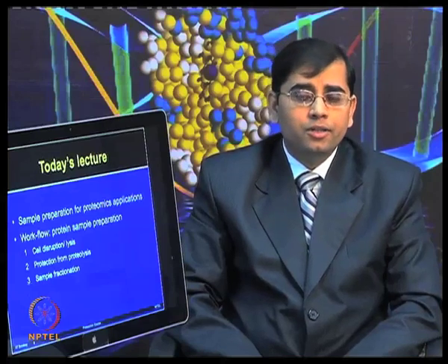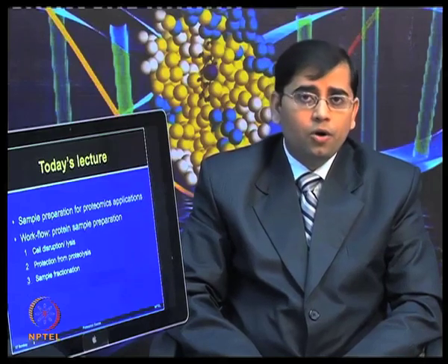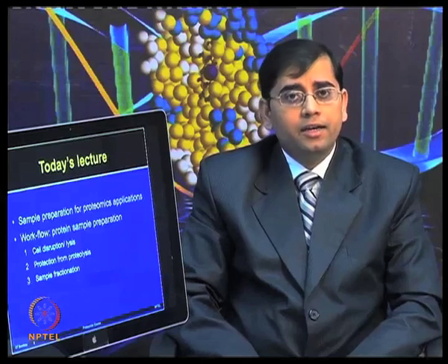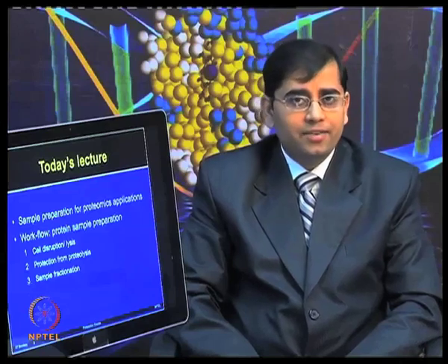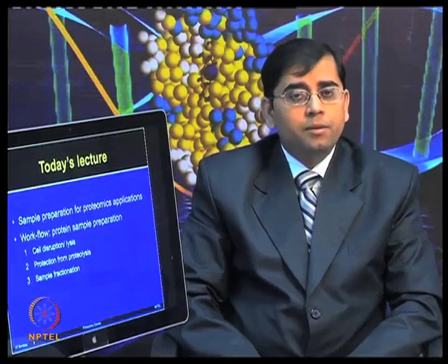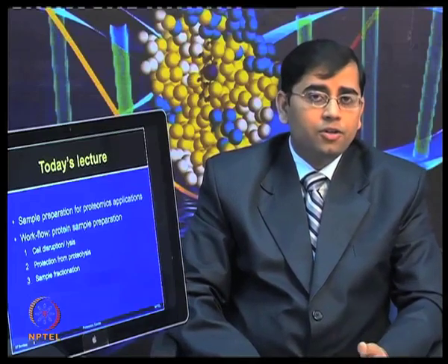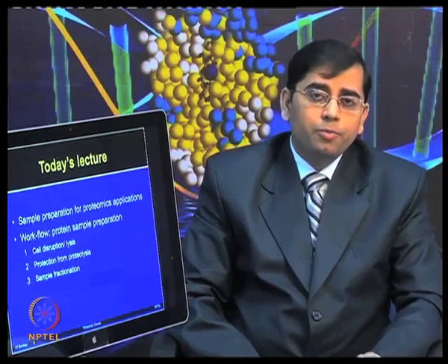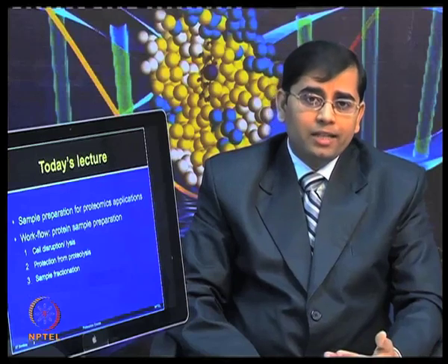So, whether you want to use two dimensional electrophoresis, dyes or different types of gel based applications, or you want to perform mass spectrometry and different types of label free techniques, you have to ensure that you are starting with a very good protein extract. But sample solubilization and some other components are added more when you are performing the gel based proteomics. So, during this lecture, I will talk to you about different types of components which are essential to make a good sample preparation for proteomic applications. I will give you a stepwise workflow.